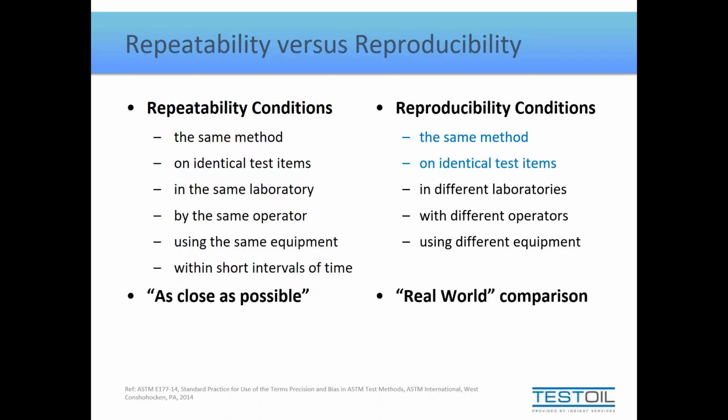Now, when ASTM defines these, it's to provide the precision and bias statements for the method, knowing how accurate this method can ever be. When they do these statements, they typically follow up with a statement saying it shall only be exceeded 1 case in 20, meaning a 95% confidence rate. So 95 out of 100 samples should be within the values I'm about to show you. 5 out of 100 could fall outside of those values, and yet the method is still considered to be valid.